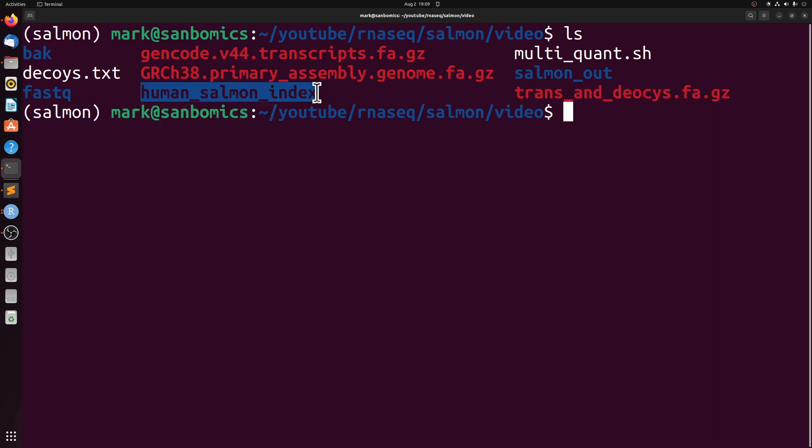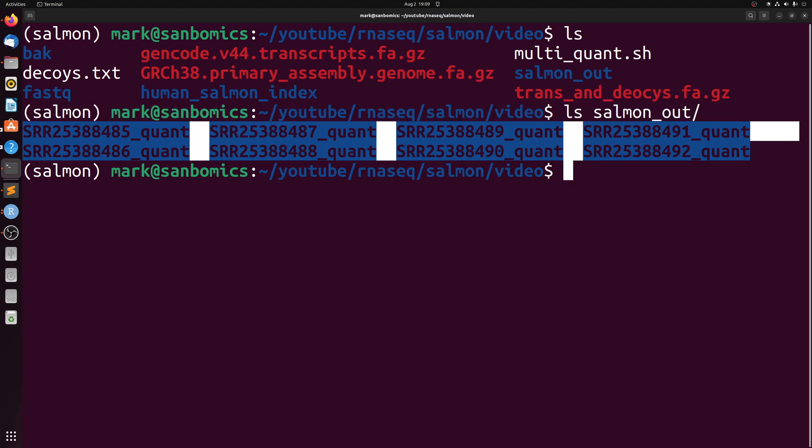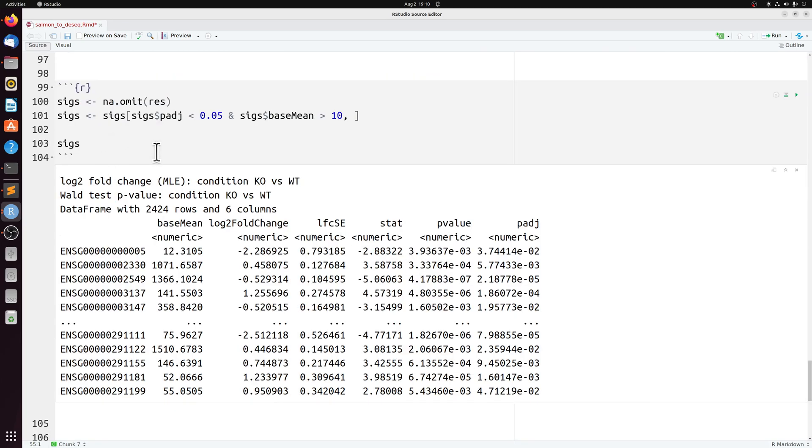We generated a salmon index, we used salmon to quantify 8 different samples, we imported the output from those 8 different samples into R, and then we did very basic differential expression with DESeq2.